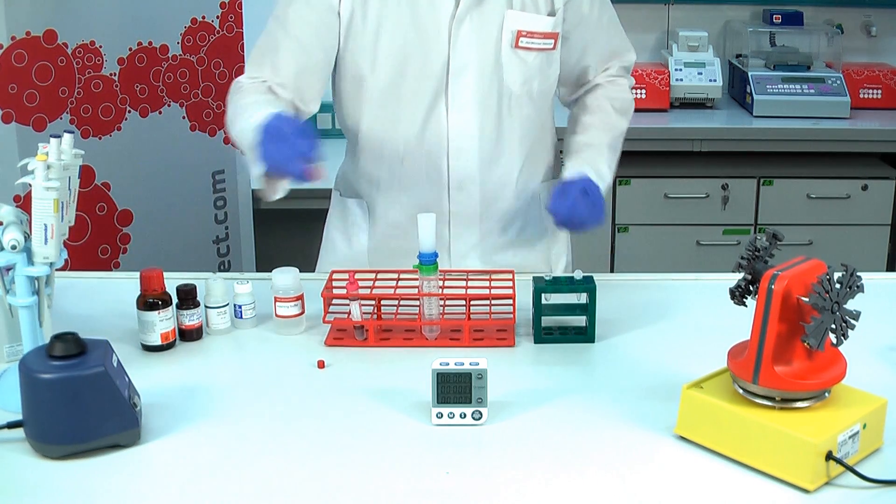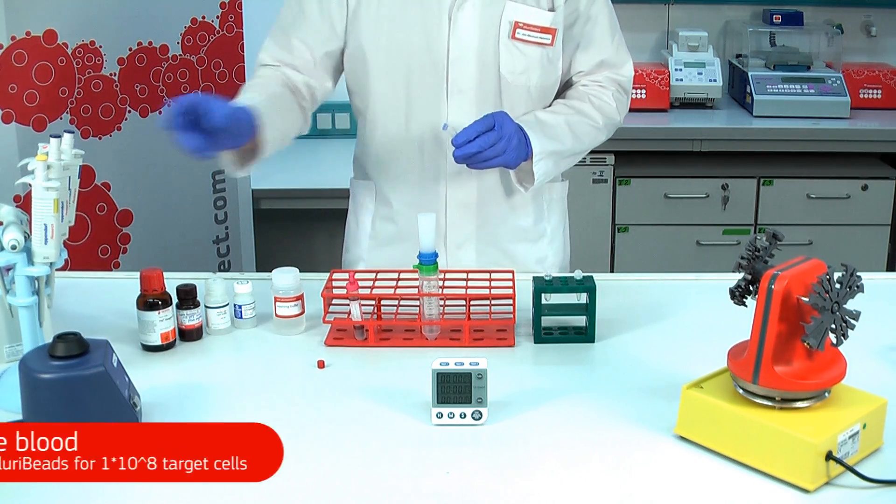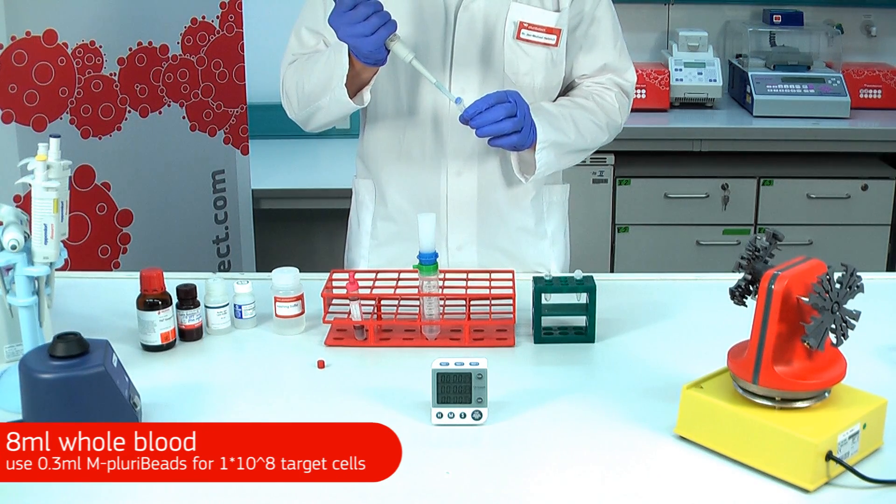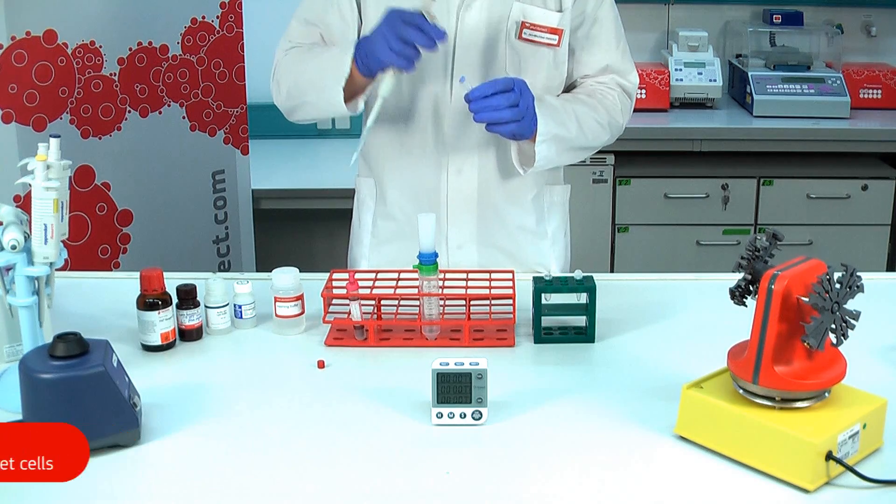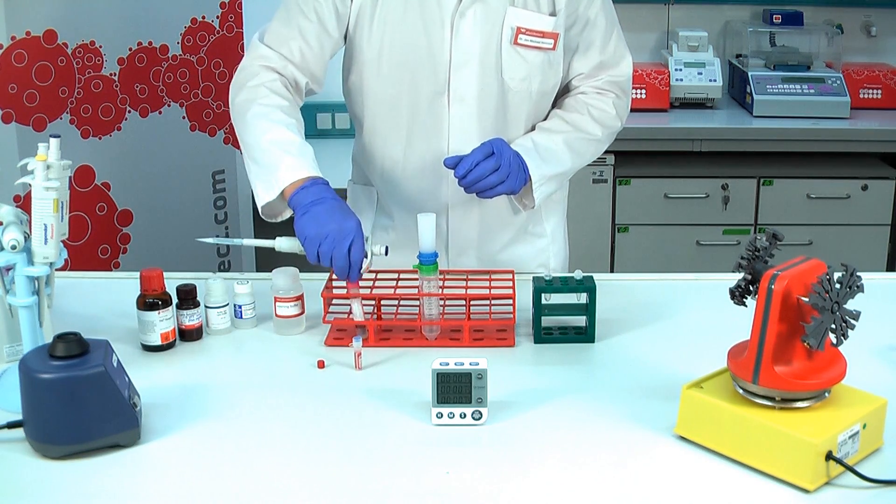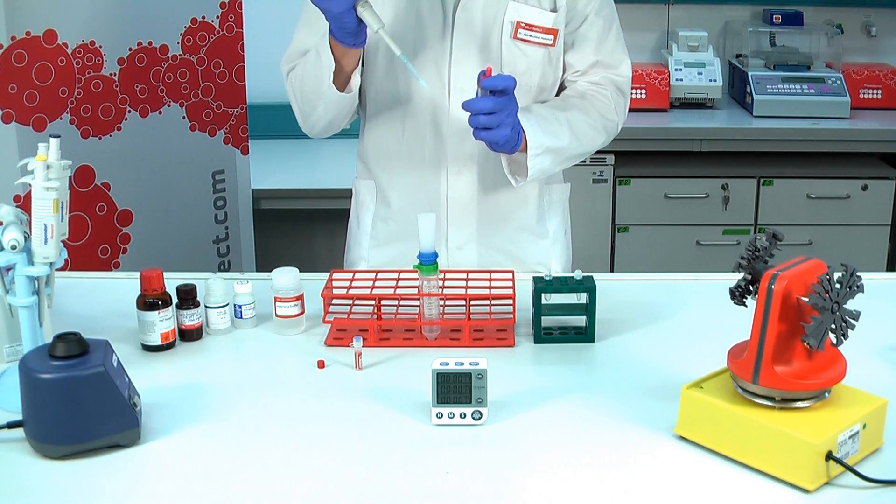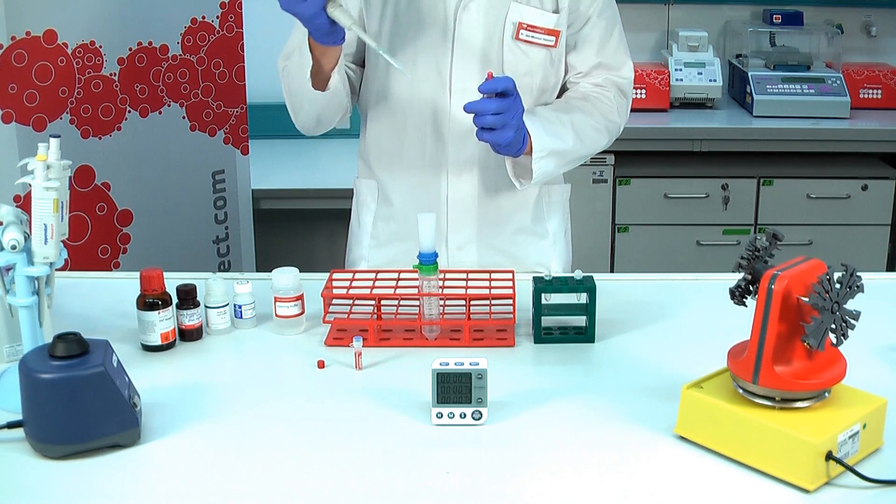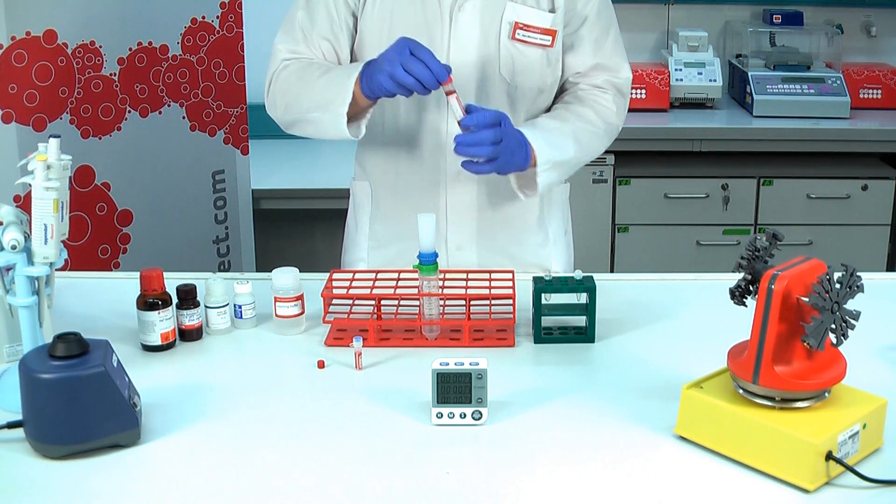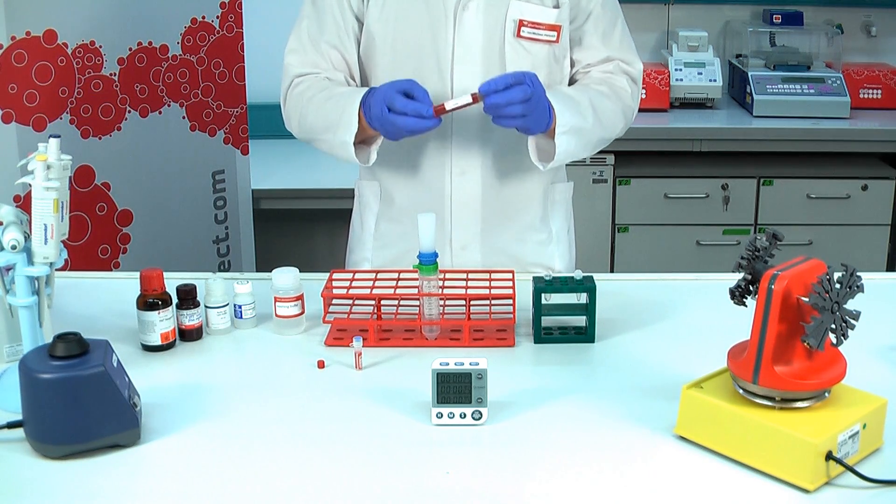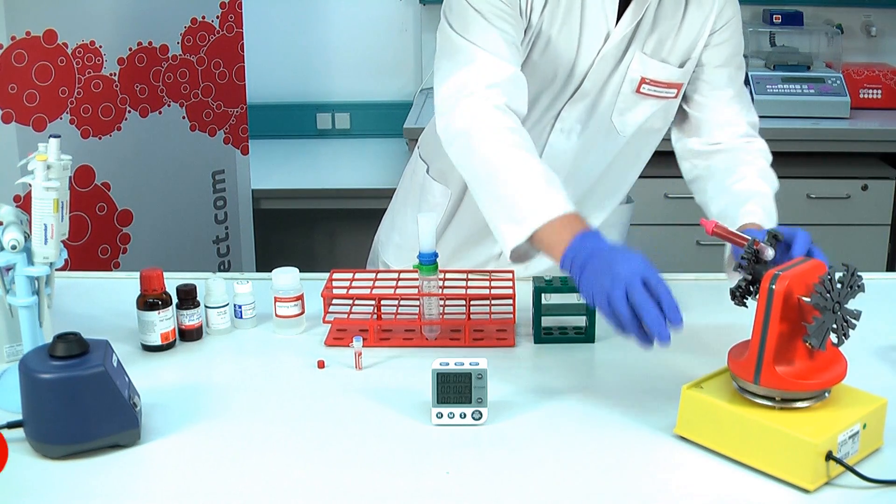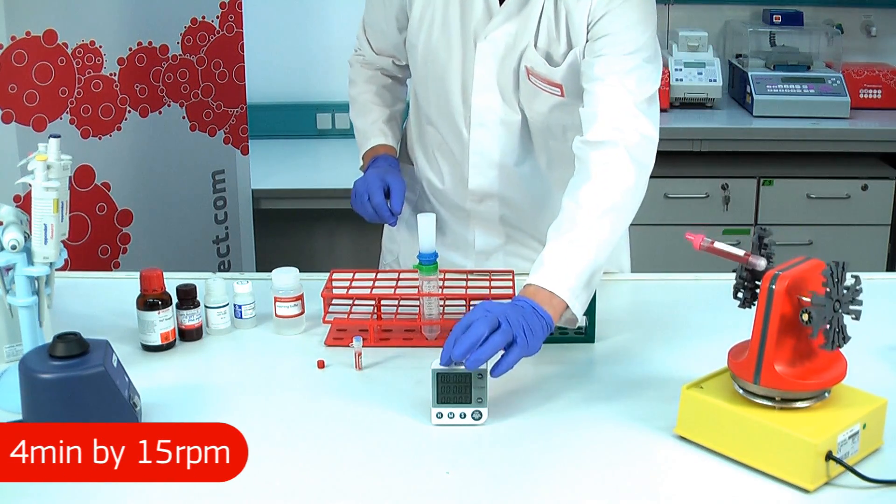Vortex the plurib beads and add them to your sample. For this tutorial we use 8ml. Tilt your sample up and down and incubate it on our pluriplex or rolling mixer for 4 minutes by approximately 15 rounds per minute.